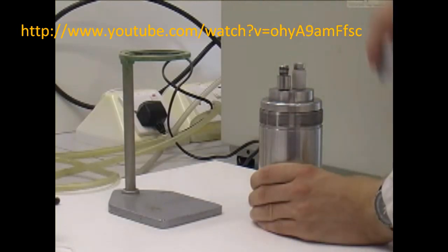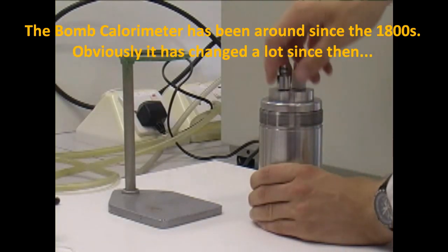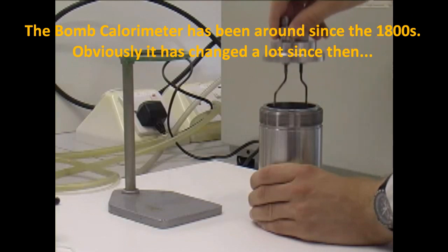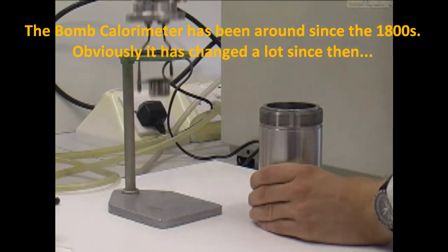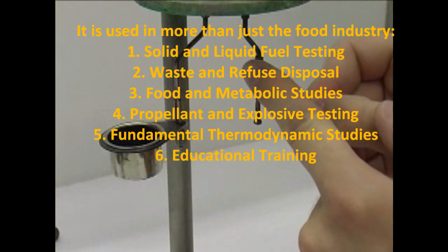The apparatus consists of a bomb shown and a calorimeter. Once disassembled, you can see the bomb consists of two sidearms and a crucible.